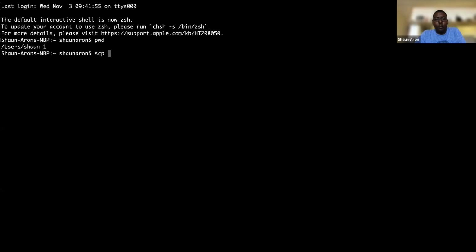Okay, so the address of the computer, right? And then I can say, sorry, and then I need the path to the files. That doesn't work.